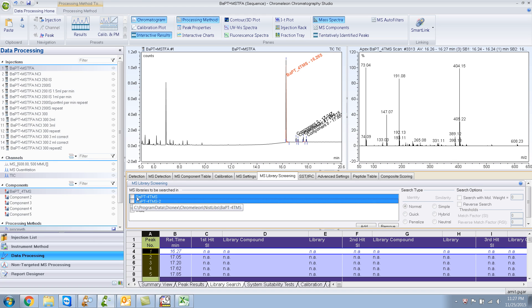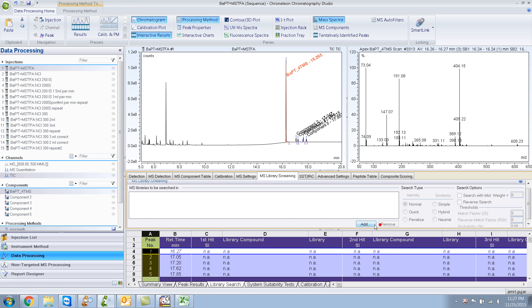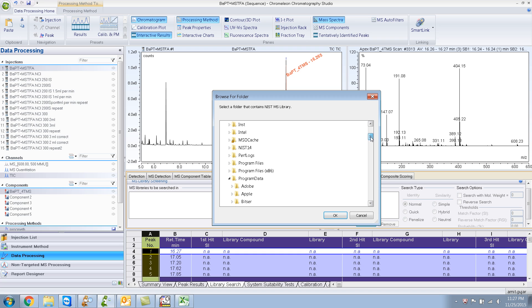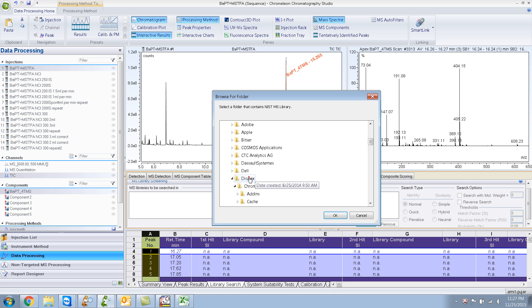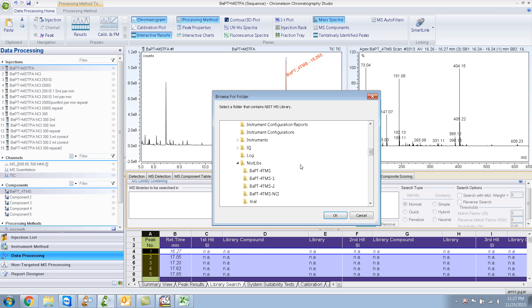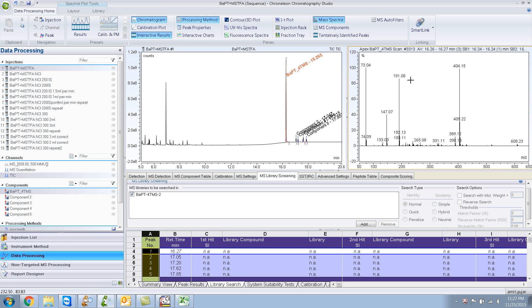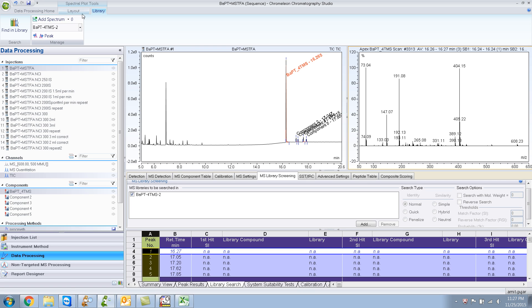Let me try and remove all of this. Let's try to add dionics. Okay, now I realize what has happened. Even though I added it to the library, I think I did not add the spectra. So the spectral count is zero right now. So you need to add the spectra. I created the library but I did not add any spectra. So let me add the spectra.